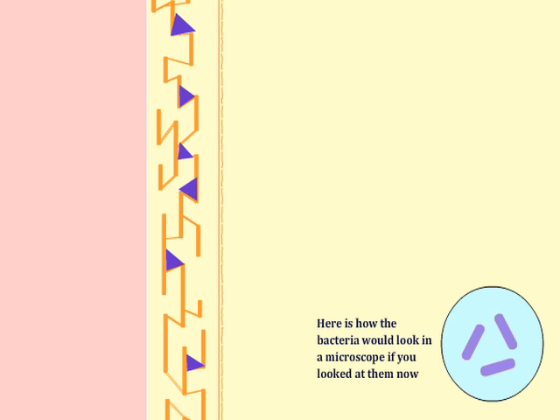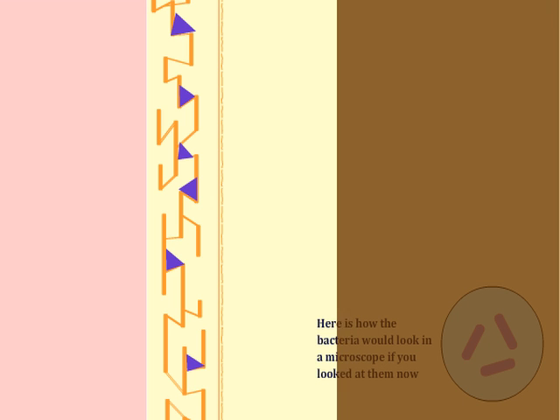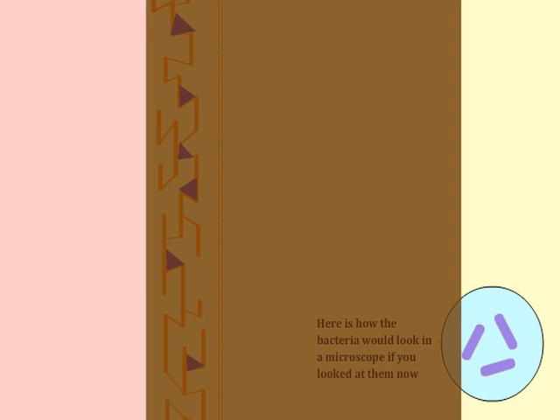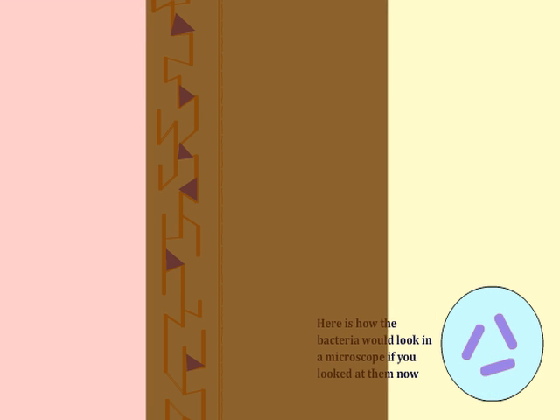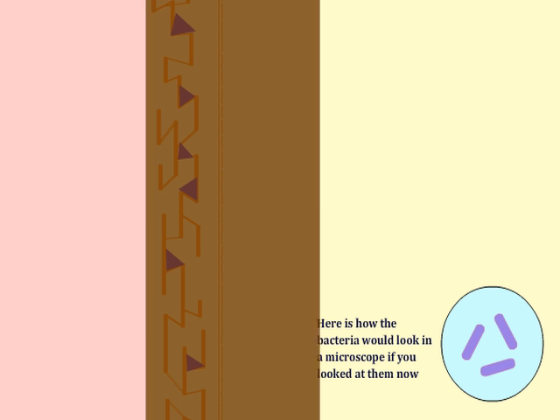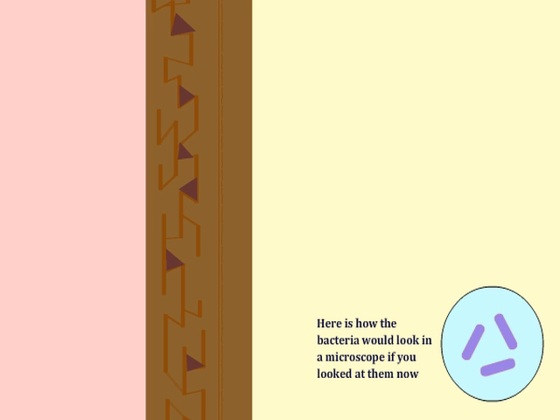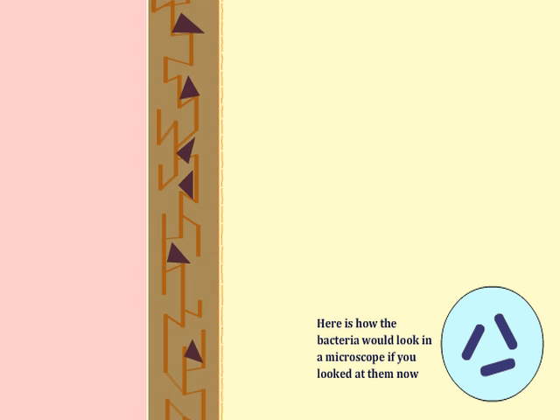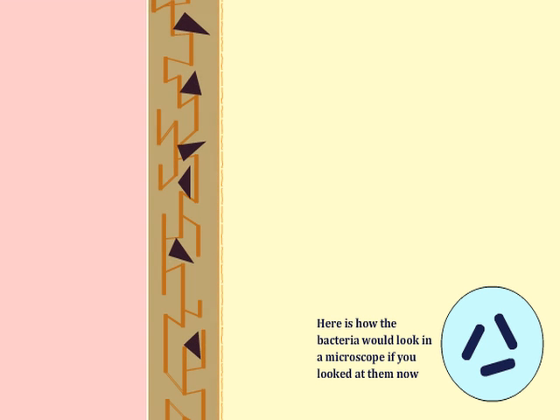Next, the slide is flooded with iodine solution for one minute and then washed again. During this step, the iodine and crystal violet combine to form a larger complex within the layers of the cell wall. Microscopically, the bacteria appear dark blue or black after this step.